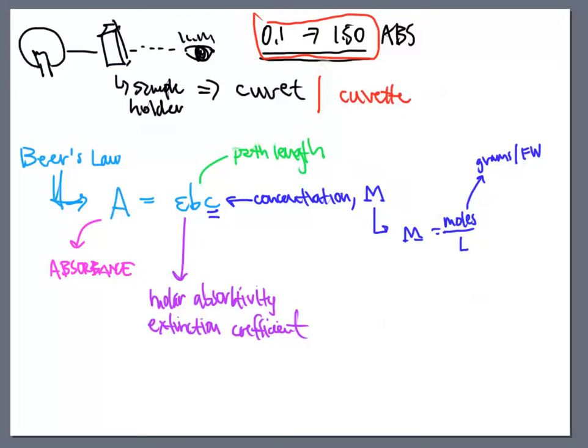Some end with an extra te. The female and male version in French, basically. So that is what we call a cuvette. We've got different types of cuvettes in a laboratory. That's what I put my sample into when I want to measure it. So if you hear us say, give us a cuvette, that's what we mean.